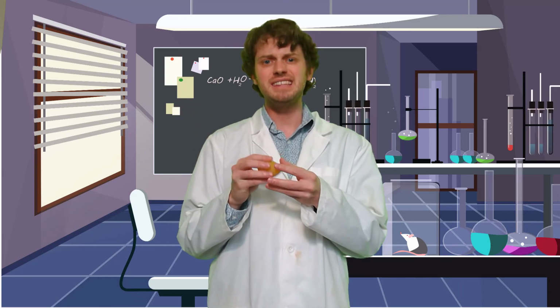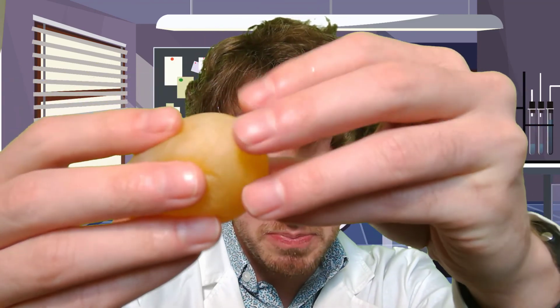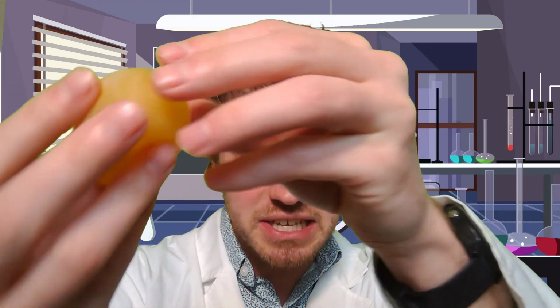All right, so I've taken our egg out of the syrup, and I've taken the mass and the circumference. So maybe you should hypothesize about what happened here. Did the mass go up or down? Did the circumference go up or down? And then I'm going to show it to you. So let me get down here again. And what I see here is this is super squishy. It's definitely smaller. It has less mass and less circumference as well. You can just tell how squishy it is, kind of cool to hold in your hands, right?